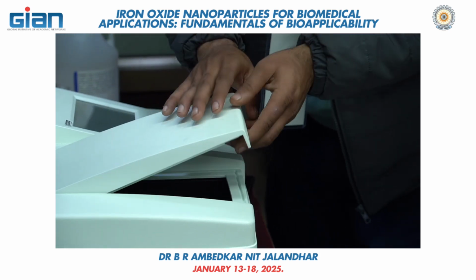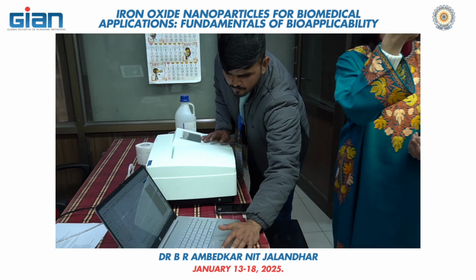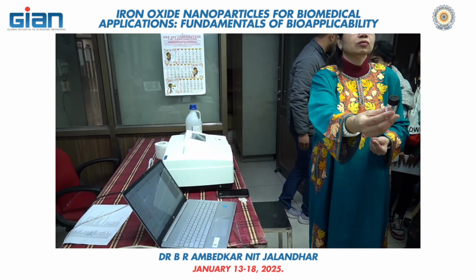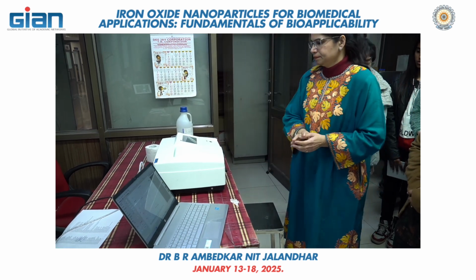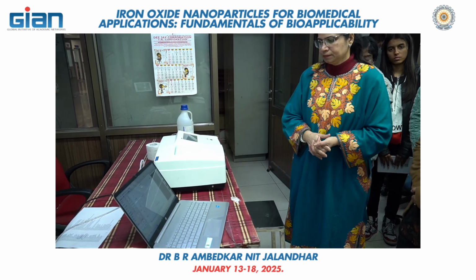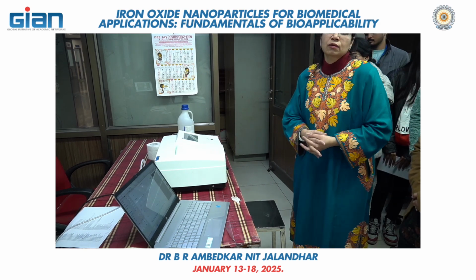So you can get back the sample, because there is no effect of this UV on your sample. It will not decompose, right? This will not disintegrate your sample. You can use it again. So you can get the sample back from the cuvette in your vial.